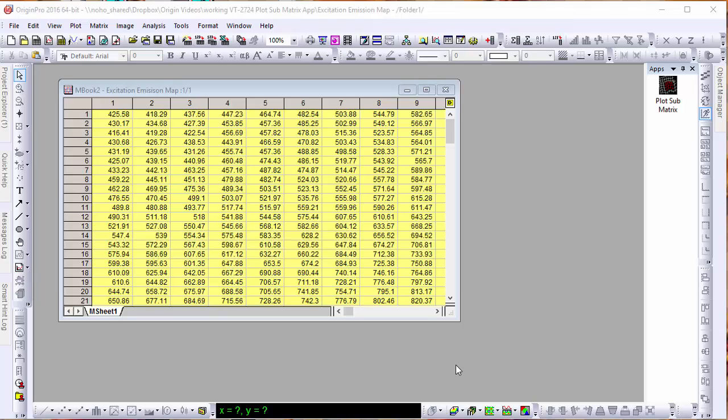In this brief video, we'll be learning how to use the Plot Submatrix app in Origin 2016. Here we see a typical matrix book of some excitation emissions data.